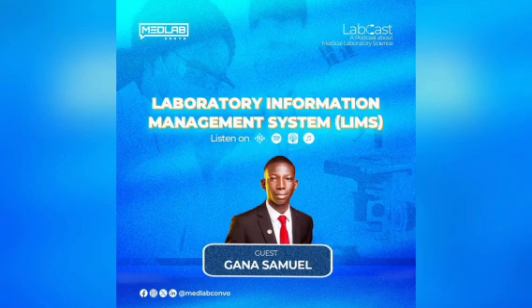Let's take, for example, a hematology analyzer. A hematology analyzer is a machine that basically does blood work, runs hematology testing on blood. So you have that machine and you have different samples. Using the LIMS, you enter each of the patient's details into the system. Because you have entered their data into the system, each particular sample is given a unique number or a unique code.